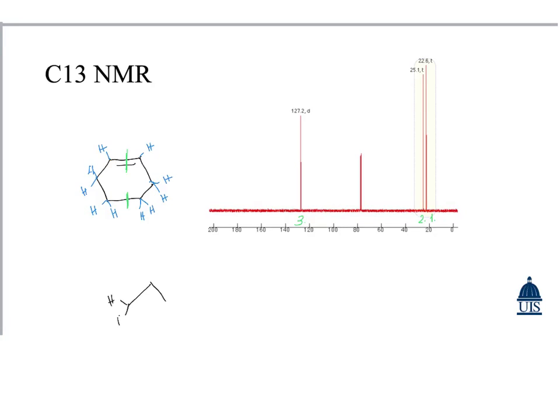This one has 2 hydrogens attached to it, this one has 2 hydrogens attached to it, and this one has 1, which is the one connected to the double bond between carbon and carbon. I don't know if you guys will remember, but for mass spectrometry, we said that there was a difference between the M plus of 41 showing the double bond between carbon and carbon. If you go ahead and add the 3 carbon molecular mass, we get 36 plus 1, 2, 3, 4, and 5 hydrogens, confirming a molecular mass of 41.